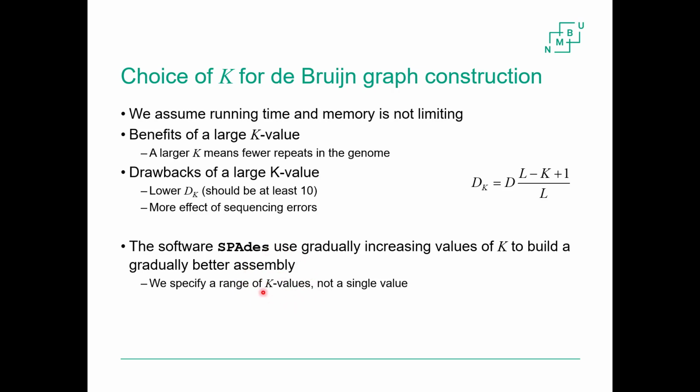And this of course makes it slow. So making an assembly with this software takes some time, but it's also considered to be the best precision you can get in using short read data.